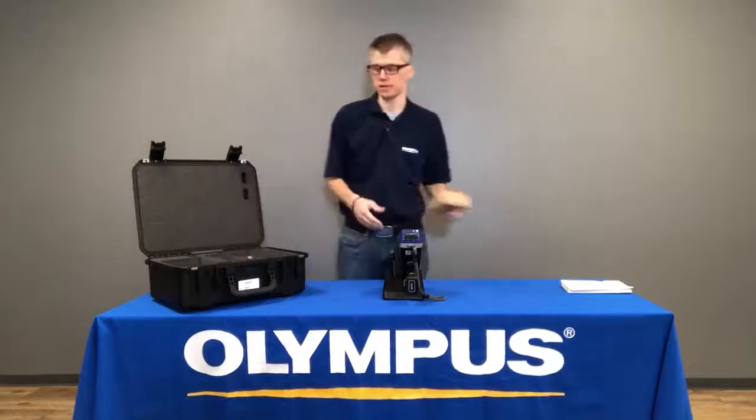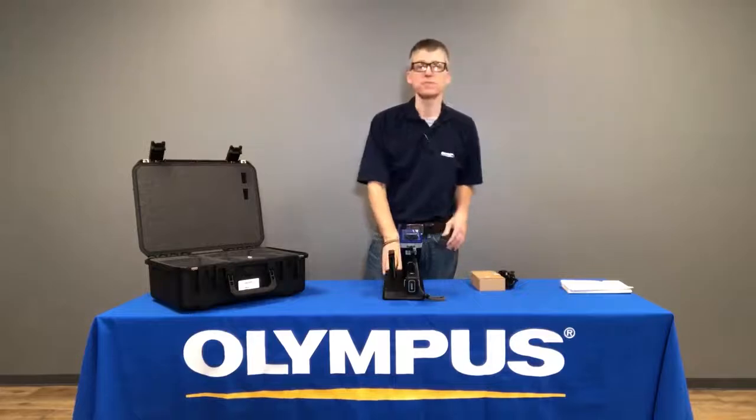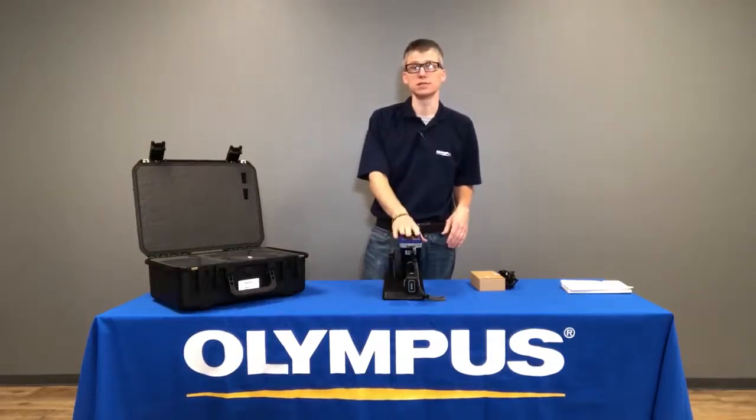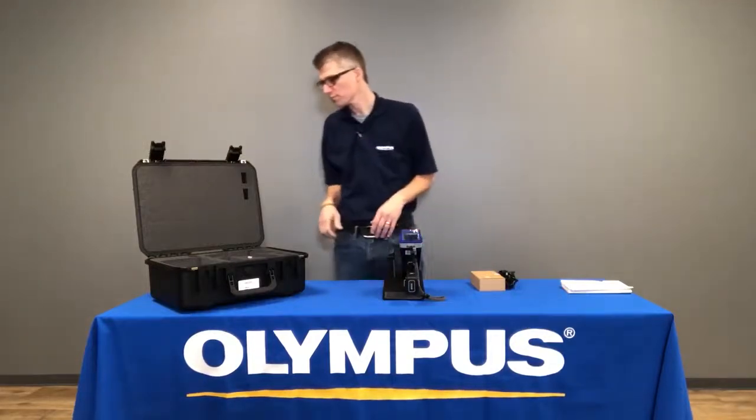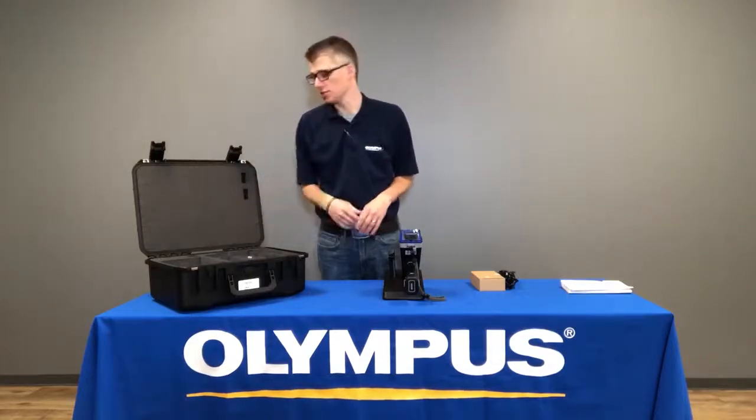There'll be an AC power adapter, and the power cord is probably under the docking station. This power cord can be used for the docking station or plugged into the Vanta directly. Under the docking station compartment are several items that you'll want to pay attention to.